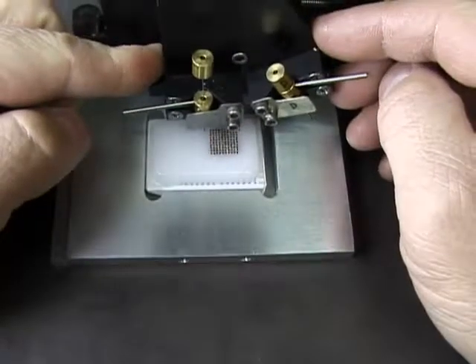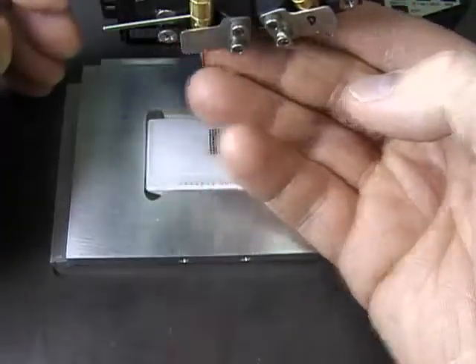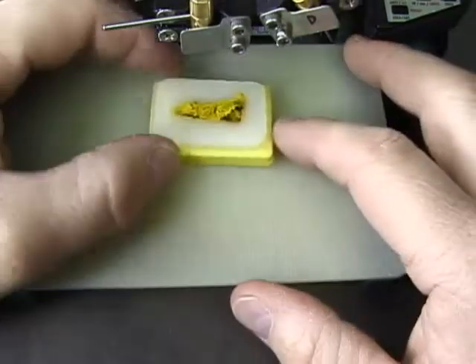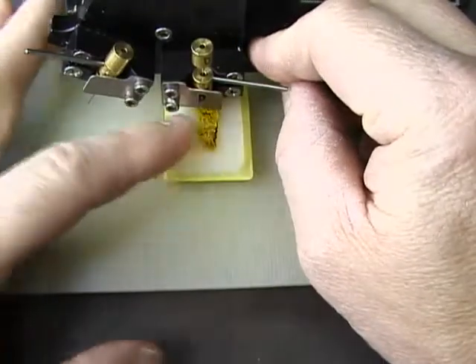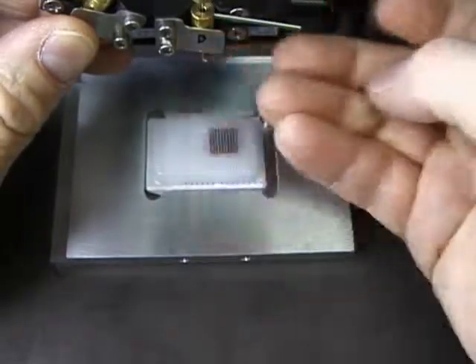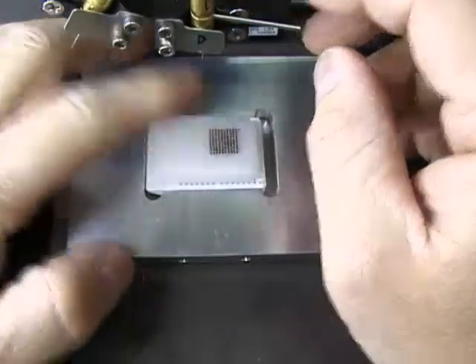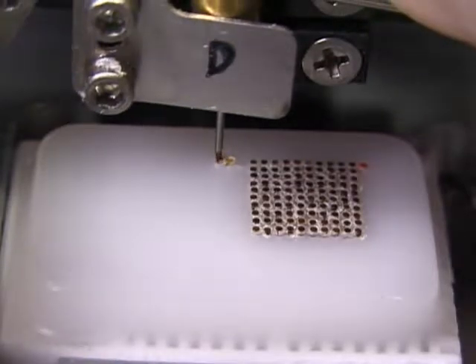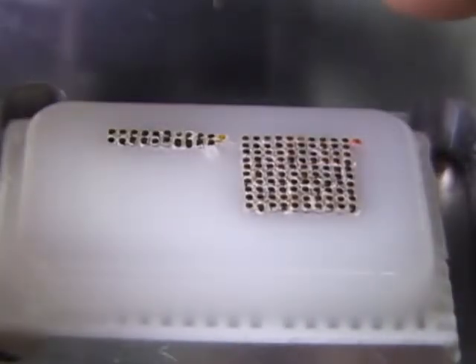You don't have to begin with a location marker in the second group, but it is nice for the slide reader's quick reference. It takes, on an average, 50 punches to develop a technique or routine for punching, so make sure your first array is a practice array.